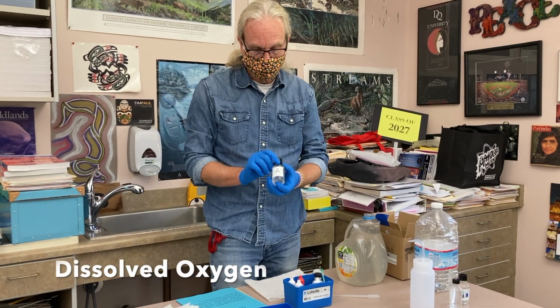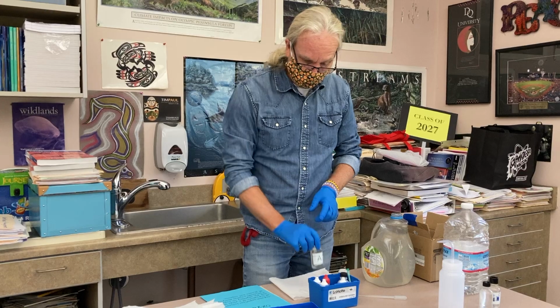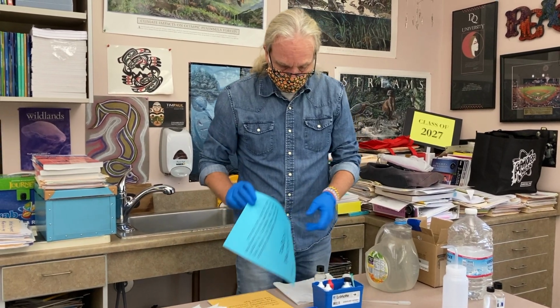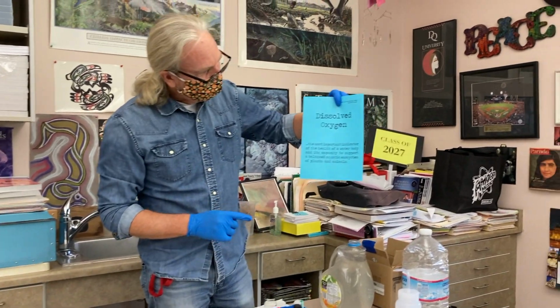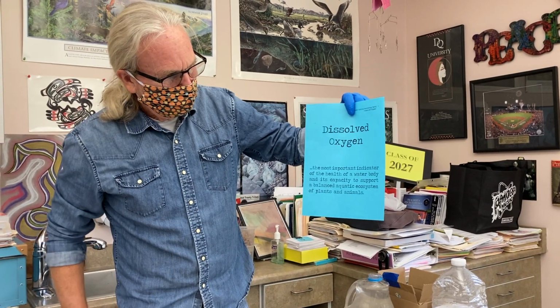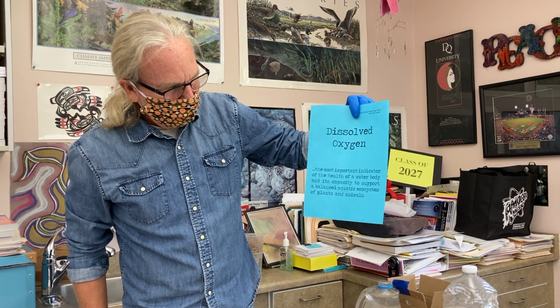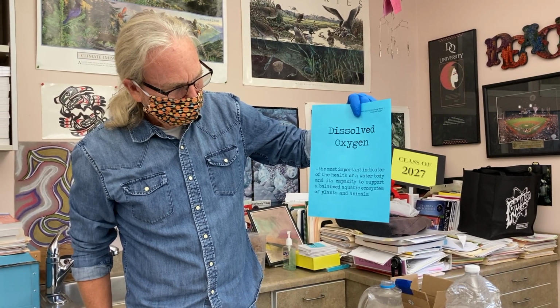Okay, we have our sample river water right here, and we're going to do dissolved oxygen. Let me just show you and read to you what it says. It says the most important indicator of the health of a water body and its capacity to support a balanced aquatic ecosystem of plants and animals. So this is the number one priority, dissolved oxygen.